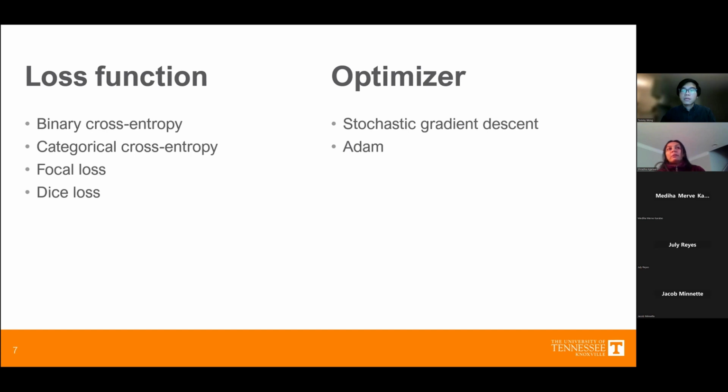In fact, what happened is that it provided more masks to my bubbles, because it is providing a bias against the negative class and supporting the positive class. So when it's supporting the positive class, it is marking more positive pixels.